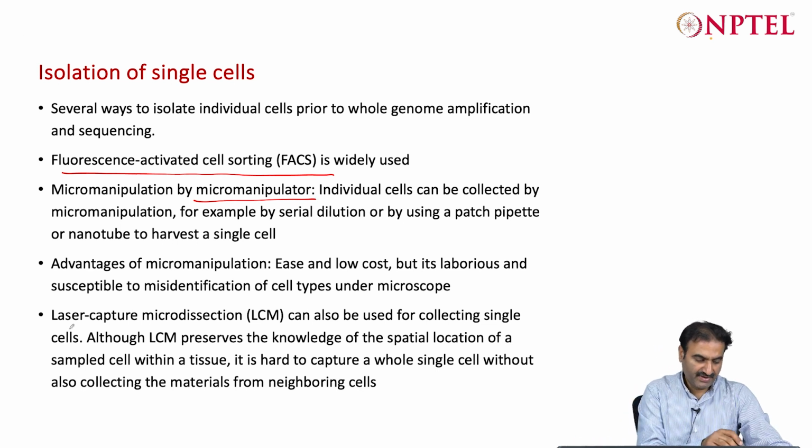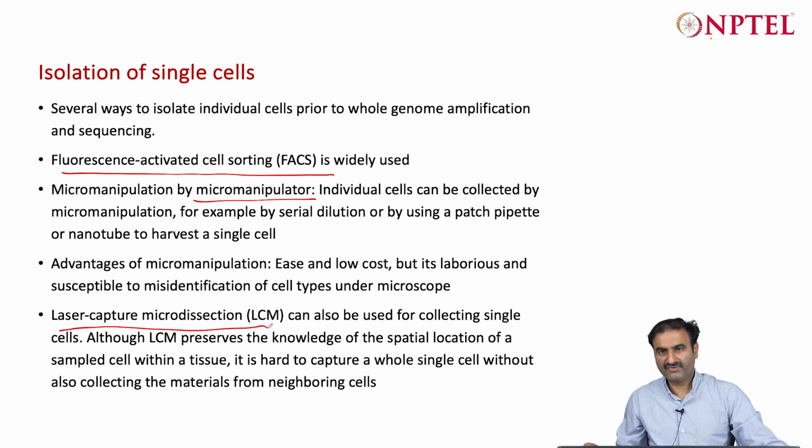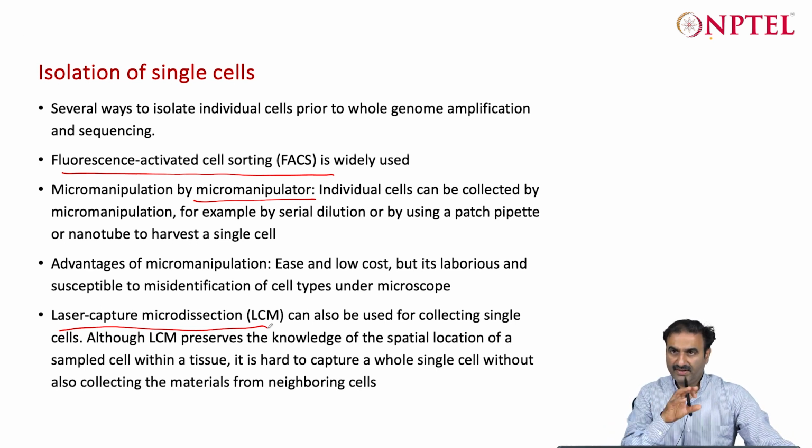Then laser capture microdissection, LCM, is also a method in which you can get a single cell, which we will see in the next slide also, how from a distinct or a very complex tissue you can get the cells.